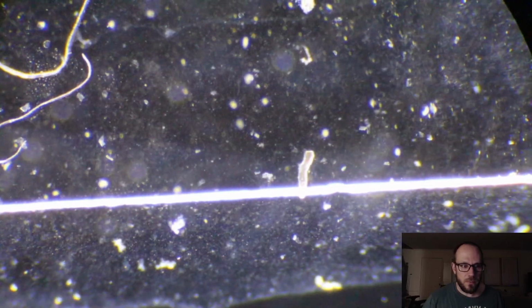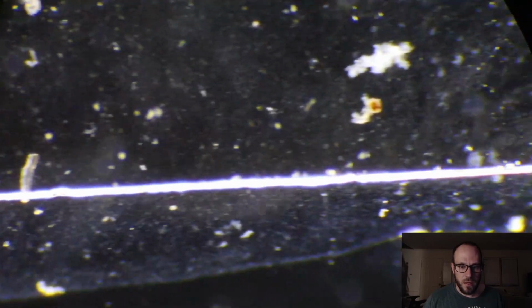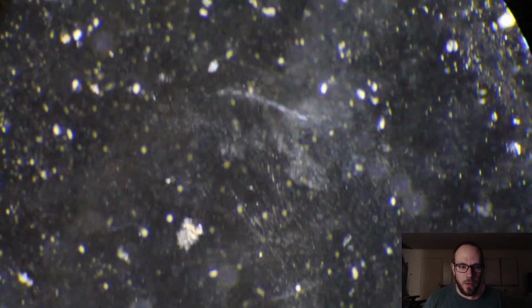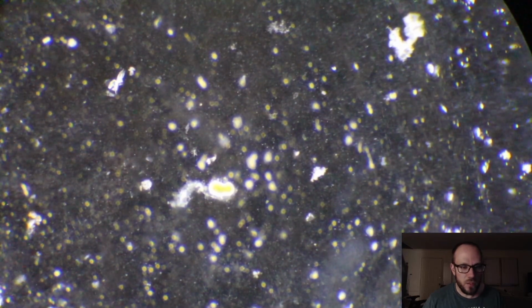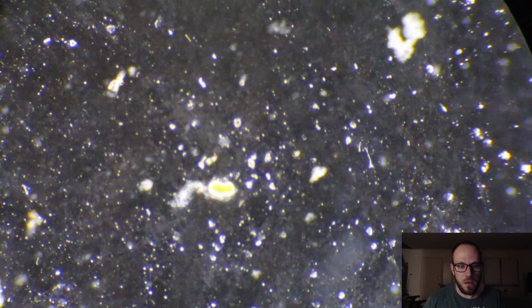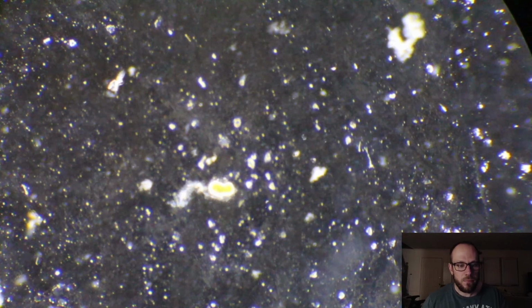So yeah, this microscope is the Microcosmos Microscope. For years and years, it was my goal to get a good quality microscope. I had several toys when I was growing up, and I was such a brat about it. I asked my parents to give me a good microscope, but they got me a toy each time I asked, which was twice.